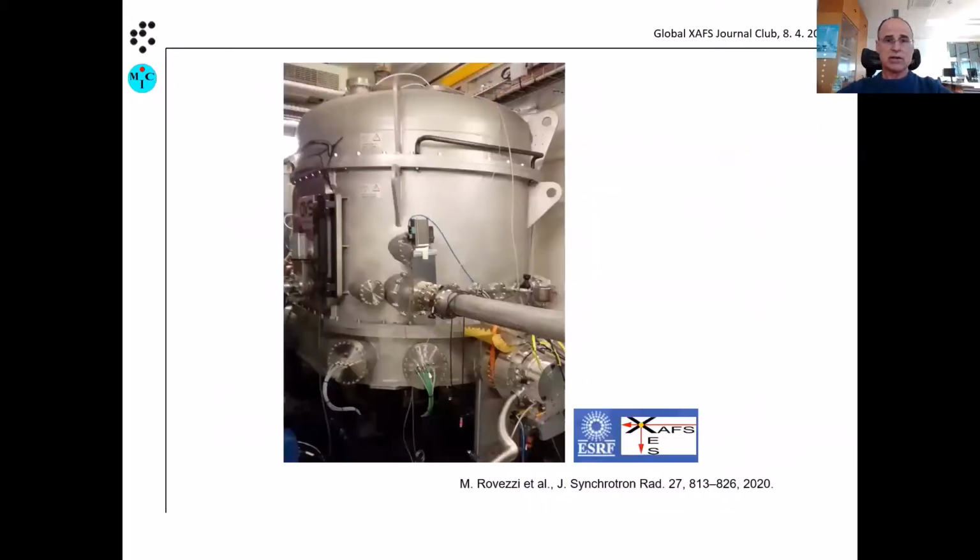And as an interesting point, this is a photo I have taken, I don't know, 2-3 years ago at the beamline. This is now the new tender spectrometer, and you see still the general principle, of course, is the same. You see the chamber, it's now, of course, with 11 crystals, much more complex mechanics, gets even larger, but it's exactly following the principle of tender X-ray spectroscopy, so windowless solution, what I have already spoken about.